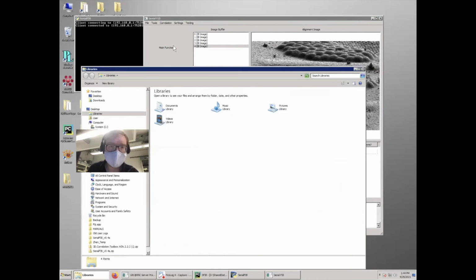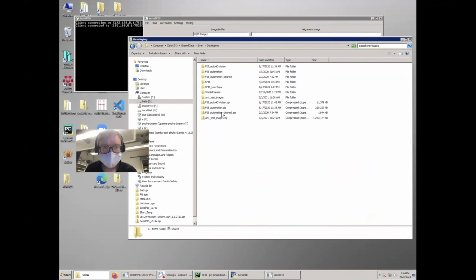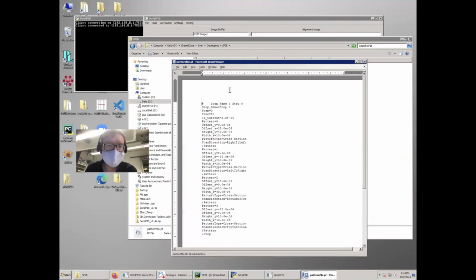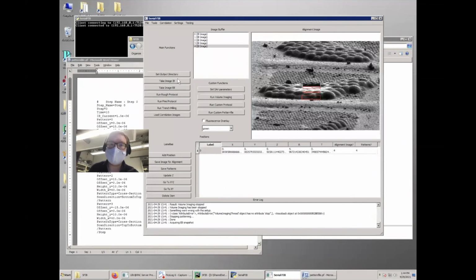I can show you real quick what the pattern file looks like. Simply again a text file where we're gonna create a little rectangle, actually a block, for example lift outs. So again, with the same procedure, right?